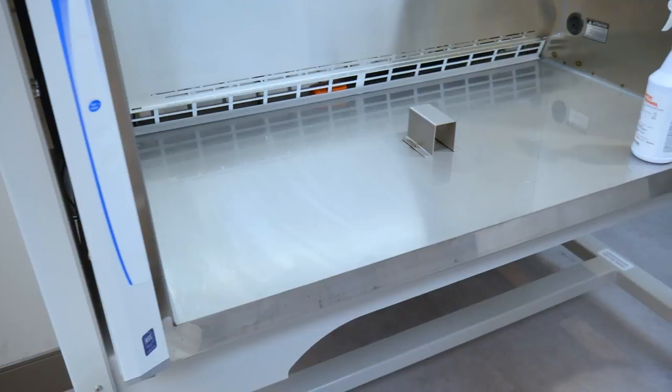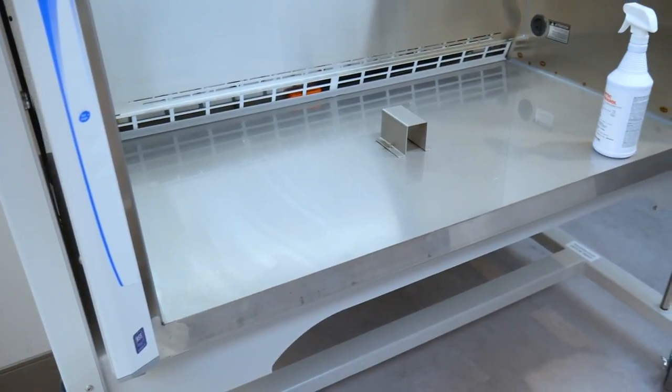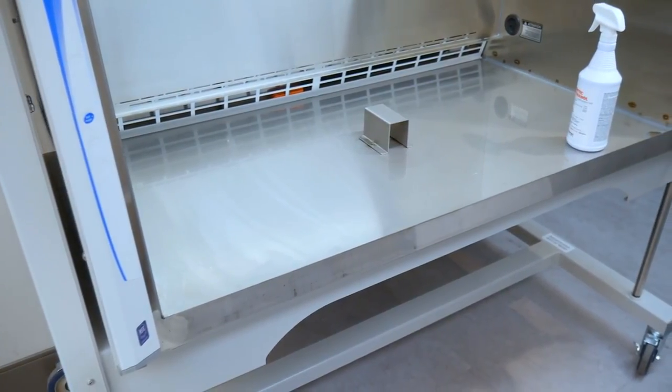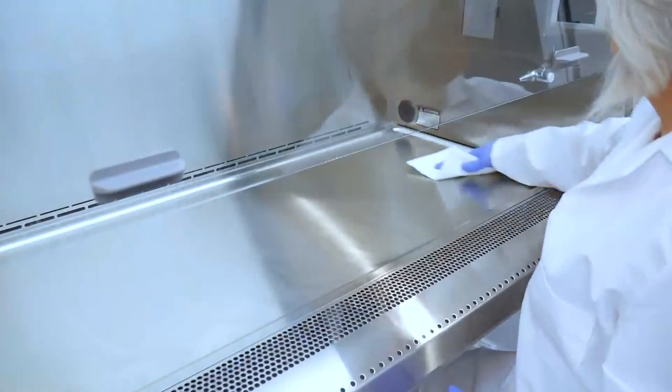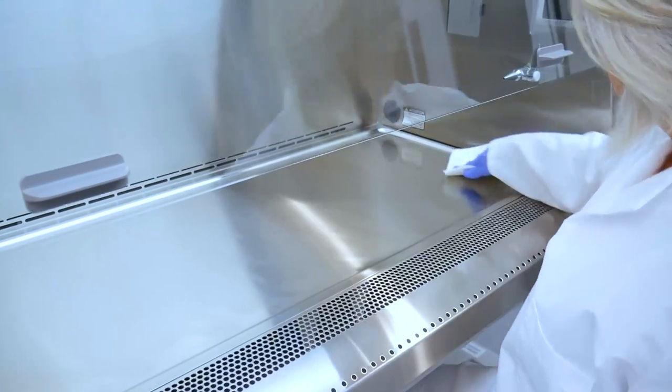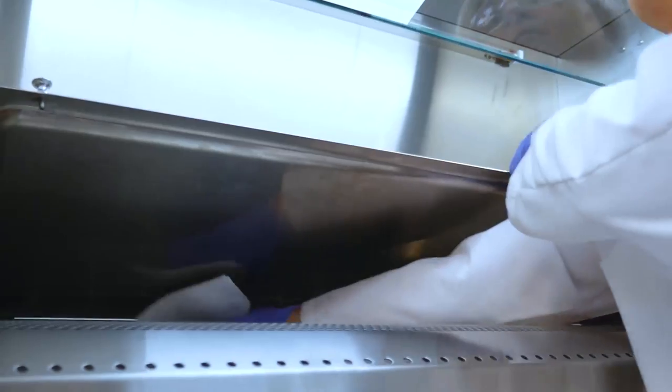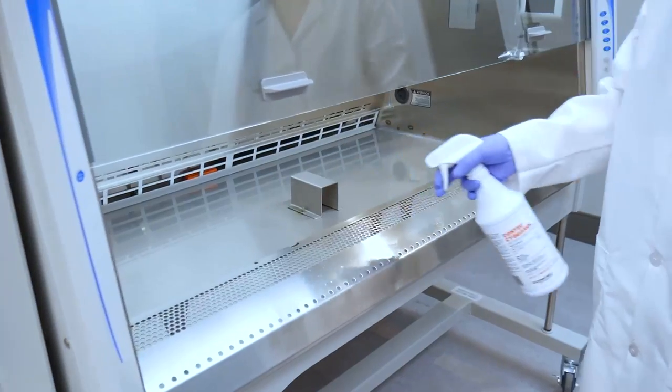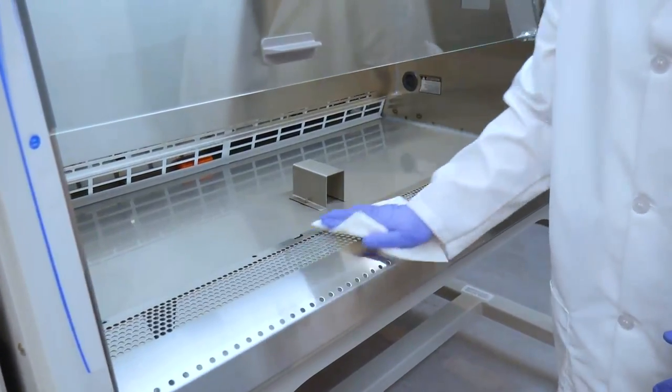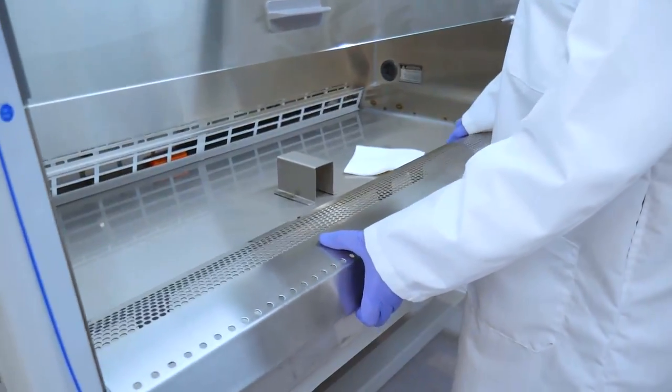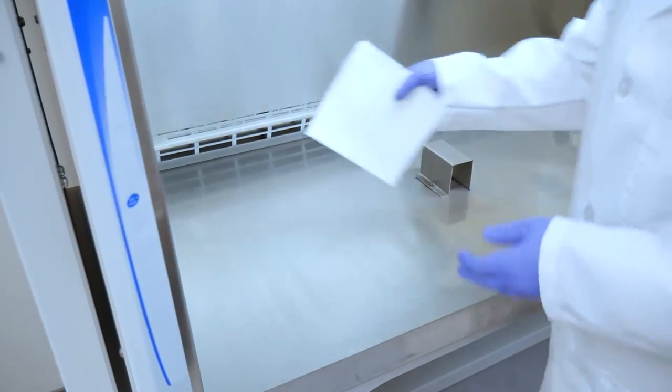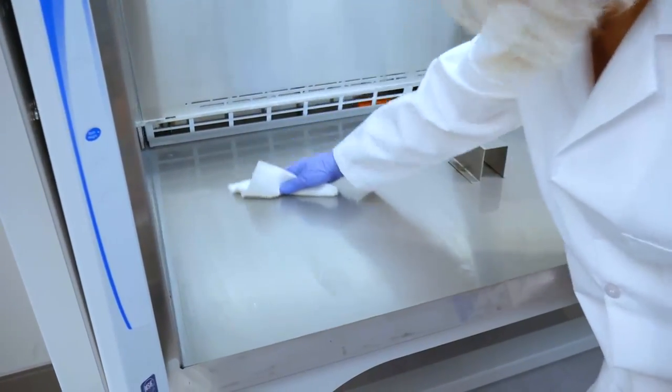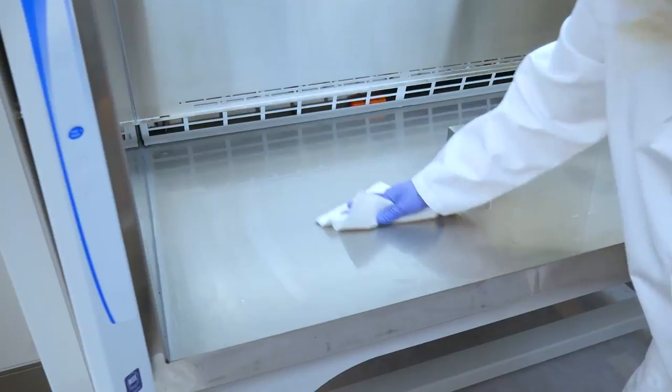In addition to daily cleaning of the cabinet's visible interior, the sump of the biosafety cabinet should also be cleaned regularly. To access the sump, first disinfect the work surface. Next, raise the work surface and clean the underside before removing. The airfoil may now be cleaned and removed, followed by disinfection of the full cabinet sump. Replace all components after cleaning and perform a second cleaning of the cabinet interior before shutting the sash.